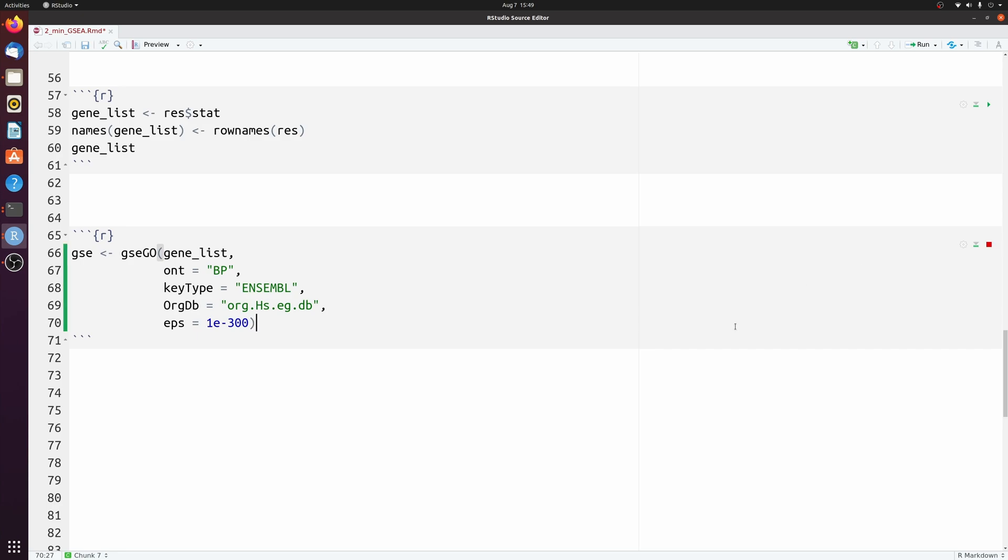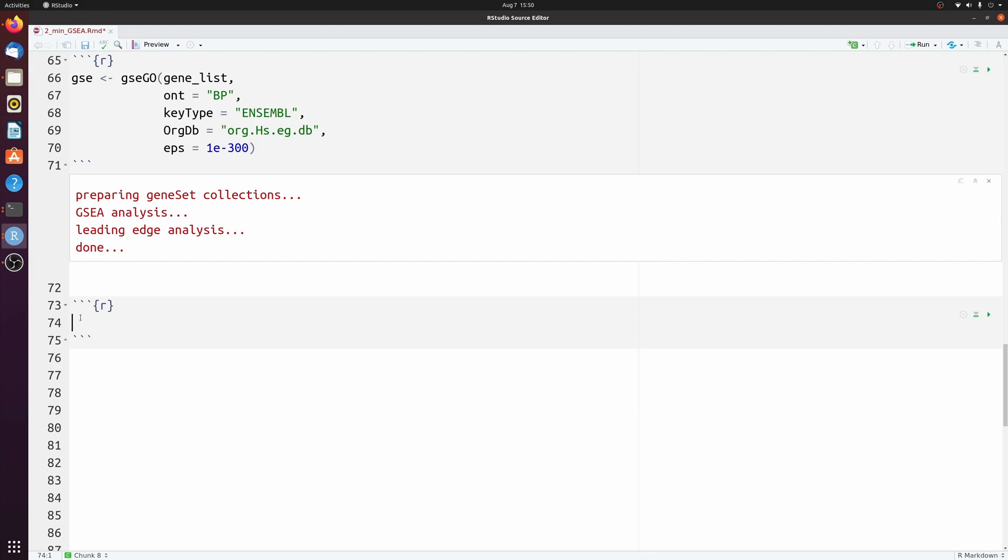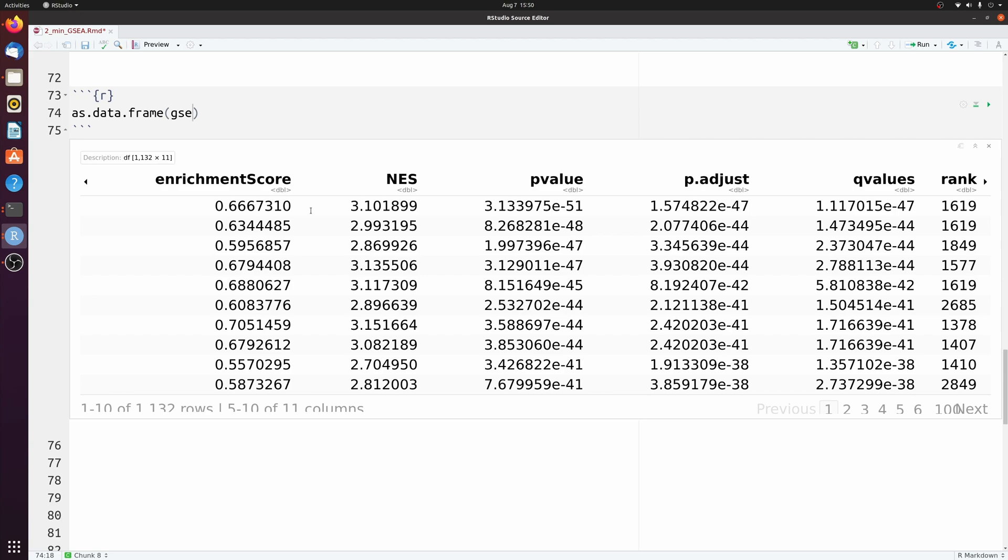So this should only take 30 seconds or so. So when that's done, you can look at the data frame version. So we have our gene ontology terms and then statistics to go with them.